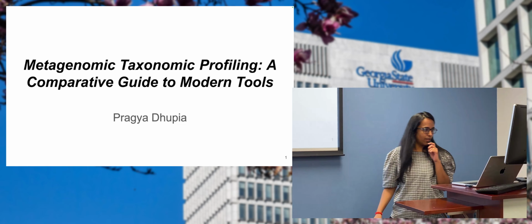So at which stage would the loss be, intermediate stage or final stage? It's going to be in the intermediate stage. And the final stage? The final is where we take the read alignment and then the subset, so whatever we lose here, we lost. Does it affect the final results? To some extent, if the species abundance is less, like less than 2% or 1%, you might lose some of the features over here. So it's very sensitive to low abundance species in that particular environment.